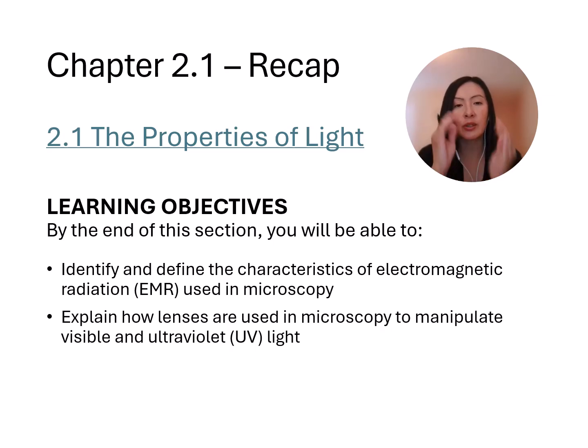And remember that the curvature of the lens and how the distance from the lens to the object will change how the image appears and its magnification. Some microscopes take advantage of UV light, specifically those fluorescence microscopes. Remember, we can use UV light to excite fluorescent dyes, and that will ultimately lead to the emission of visible light as their excited electrons fall back to the ground state.